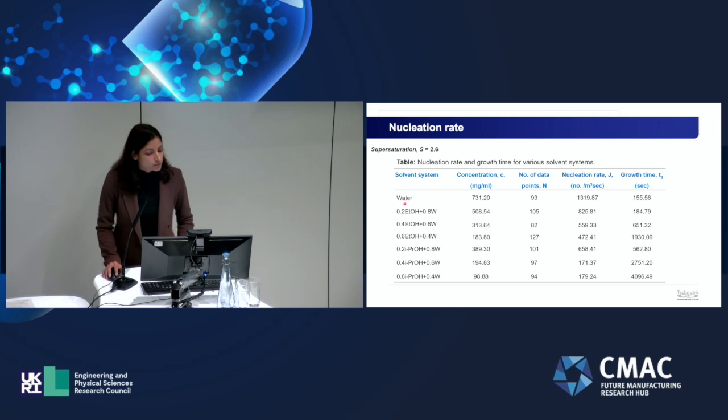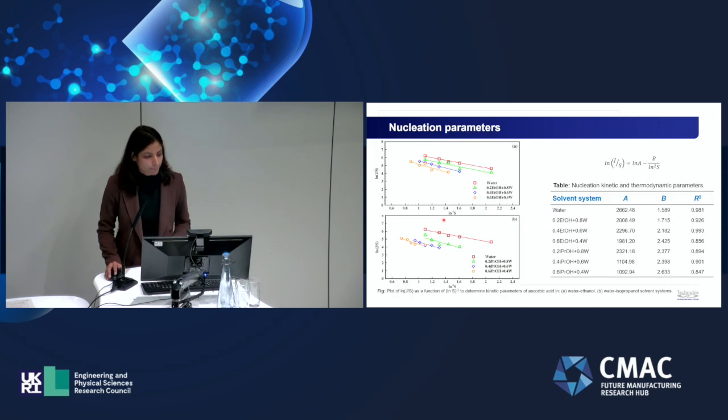If you want to see the effect of different solvent systems on the nucleation rate, this is a comparison at one supersaturation. And here we can see that nucleation rate decreases with increase in the alcohol concentration for both water-ethanol and water-isopropanol solvent systems. And on the other hand, the growth time increases with increase in the alcohol concentration, which indicates that ascorbic acid has a high nucleation rate in water.